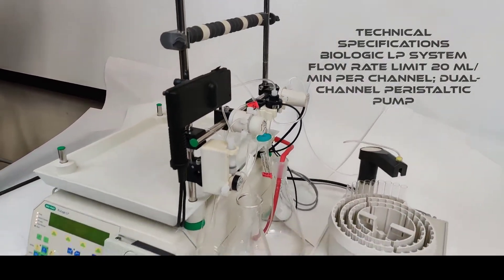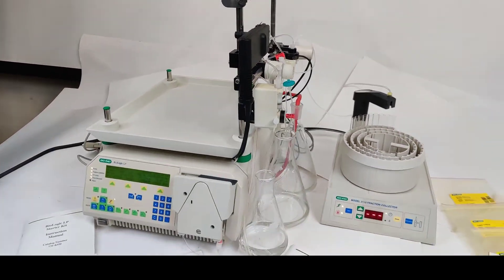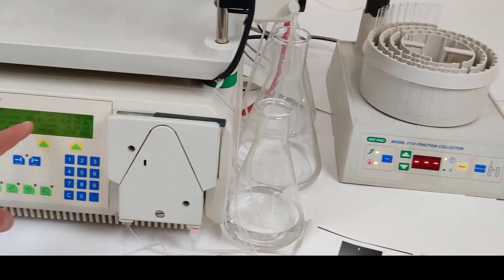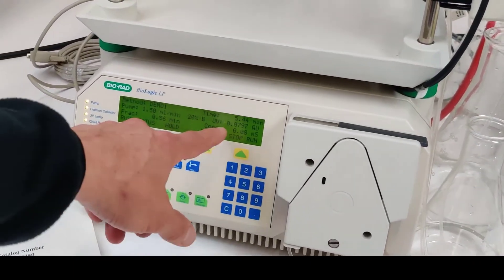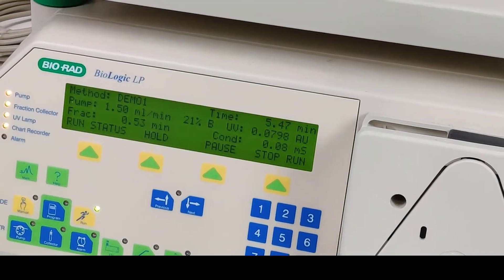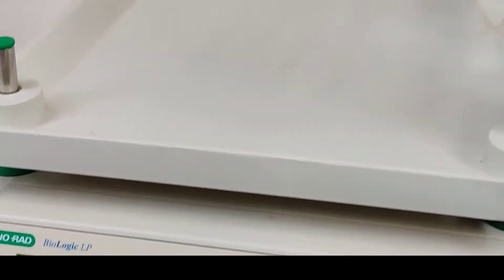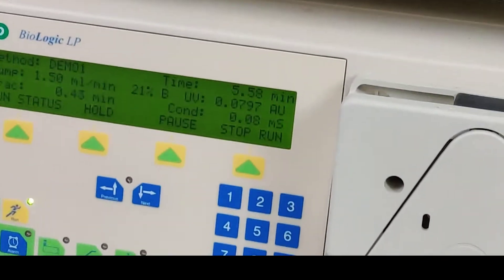So we are pumping into our system. This is buffer A and B. Here you see the flows, the settings, the rating of your UV, and the conductivity in millisiemens.